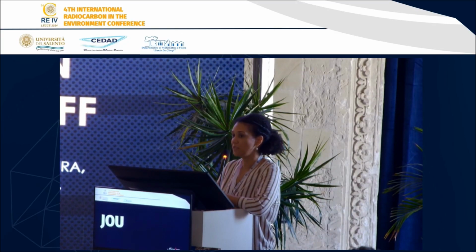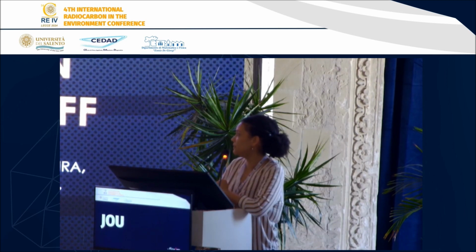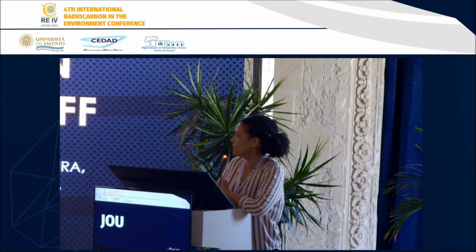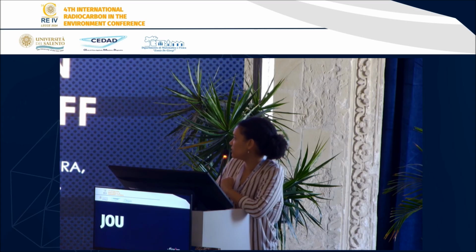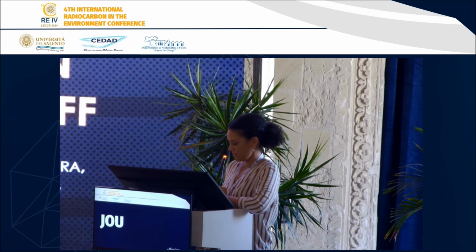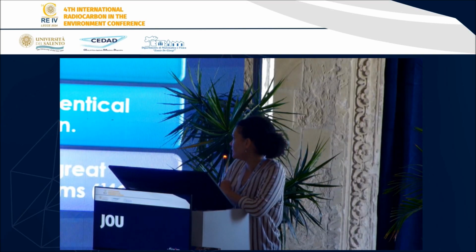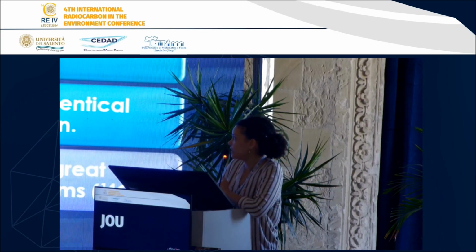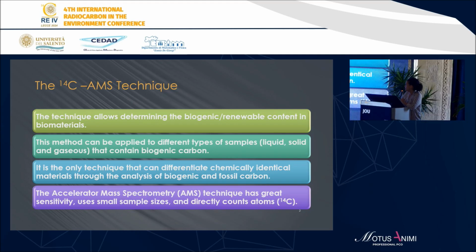In the big project we have in LAC, I use biofuel samples, and the name of this project is handling liquid biofuel samples for biogenic fraction determination at LAC UFF. The AMS technique is highly sensitive and can be used for determination of biofractions in biofuels. It can differentiate chemically identical materials through the analysis of biogenic and fossil carbon.